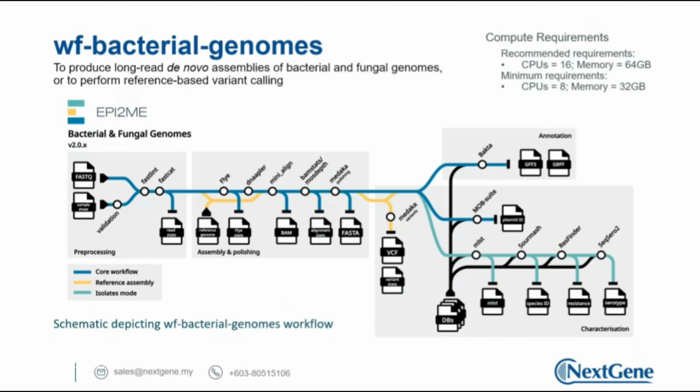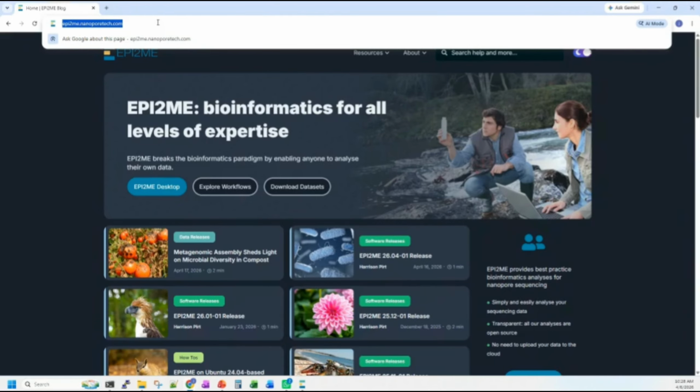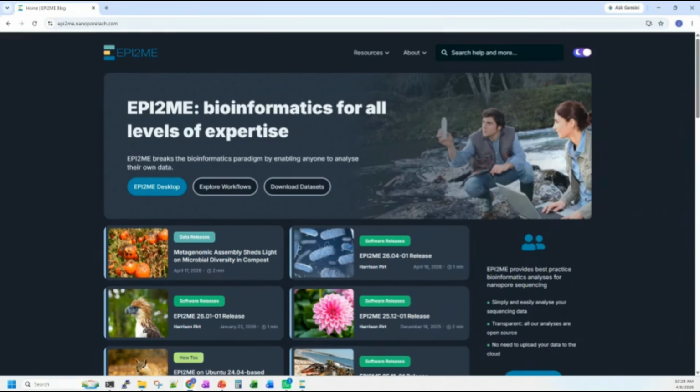Okay, so let me try to bring you to where we can get the Epi2Me software. The Epi2Me software is free for the public to download and use, so there's no limit on who can access it. Let me share the link into the chat box over here. This is the website where we can download the Epi2Me software.